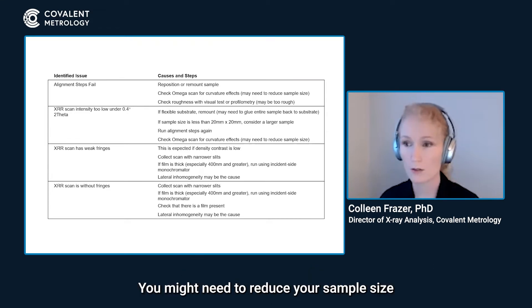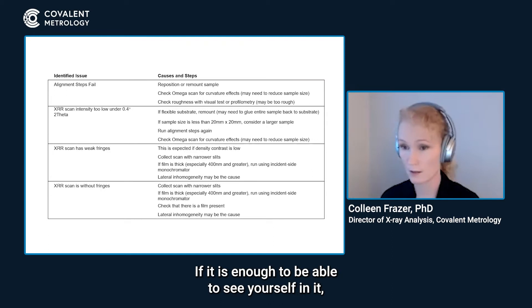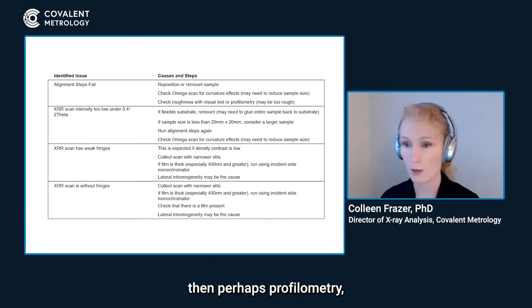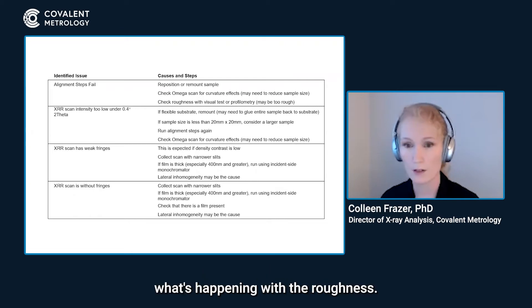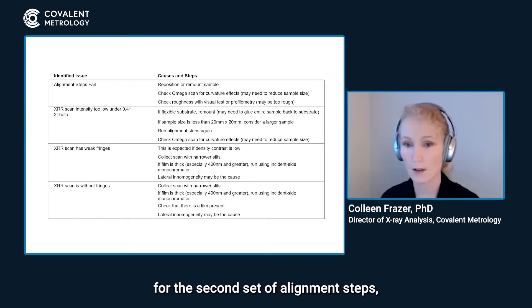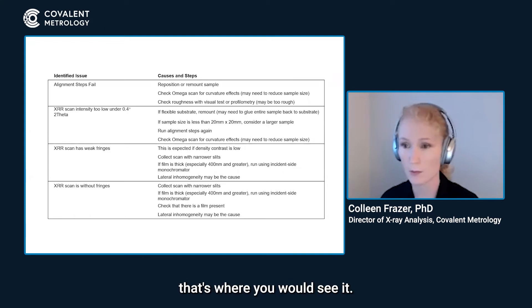You might need to reduce your sample size to reduce the curvature effects. For roughness, use a visual test or profilometry — just look at the surface. If it is reflective enough to see yourself in it, then profilometry or some other analysis can tell you what's happening with the roughness. Roughness can be so severe that for the second set of alignment steps at a fringe, you effectively don't see anything but the omega optimization.